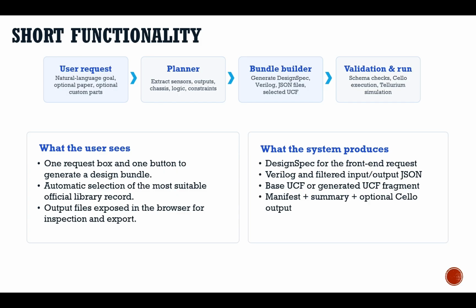Our project is an LLM-assisted design pipeline for synthetic biology that bridges high-level user intent and low-level biological implementation using Cello v2. Users can describe a desired biosensor circuit in natural language, and the system automatically generates Verilog input and output JSON files and the compatible UCF configurations required for Cello execution.